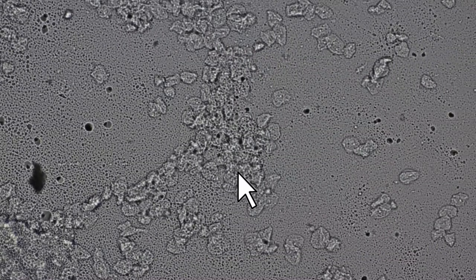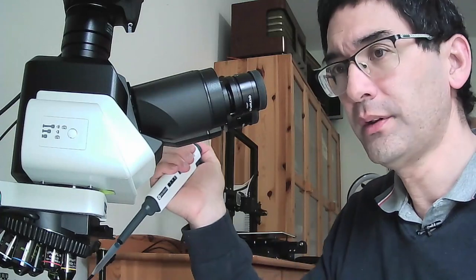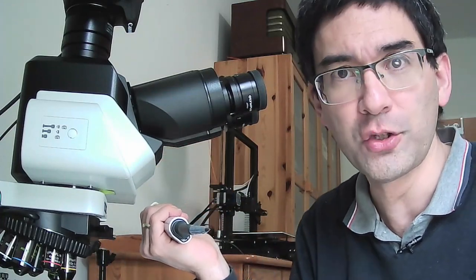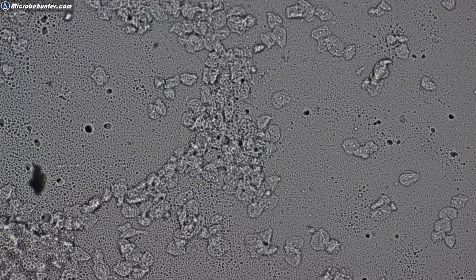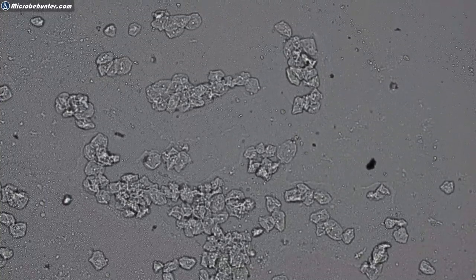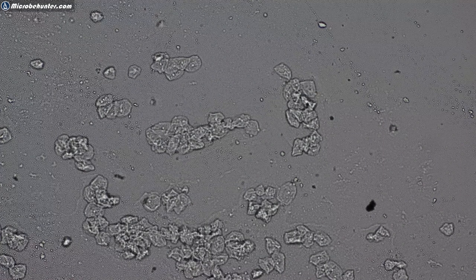And I'll be doing the following. I'm going to add now over here the methylene blue, the Löffler solution it's called, and then you're going to be able to see what happens. So let's see if this actually works. Okay, some of the cells might actually be swept away. Oh, okay, I'm not pushing on the, even this one is not so easy.